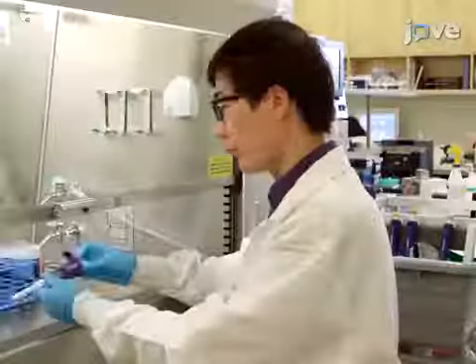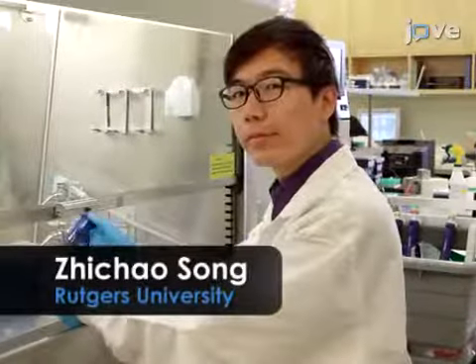Importantly, this technique provides an in vitro cellular system that can be used in parallel with in vivo mammalian animal model systems. Demonstrating the procedure today will be Azadeh Jadali, a postdoctoral fellow in my lab, as well as Zhichao Song and Alejandra Laureano, 2 graduate students in the lab.